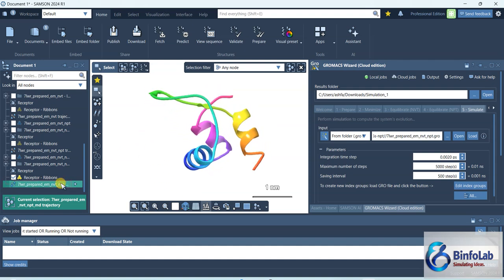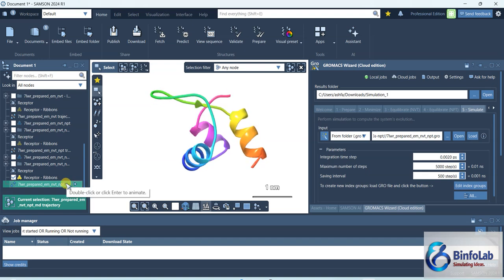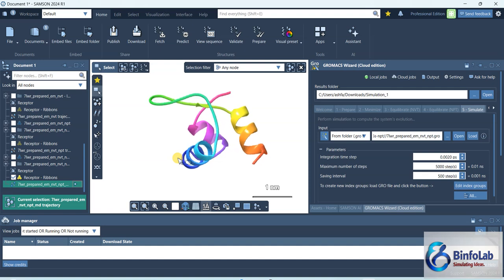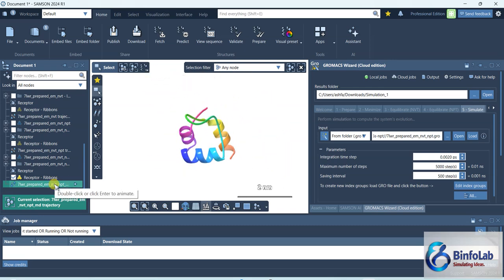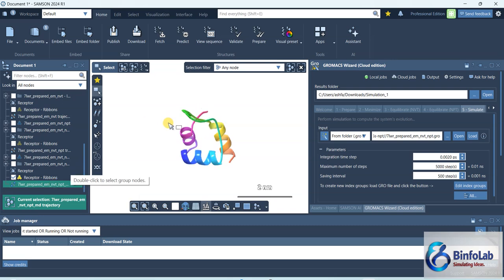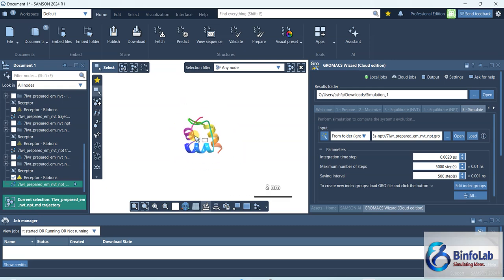So that's it. Now it's up to you how to perform simulation, to take someone's help, to prepare by your own self, or even I told you that I can help you, but that will be a bad thing. So let's see. My job was to teach you how to perform simulation with SAMSON. Okay, I'm not going to take much longer.